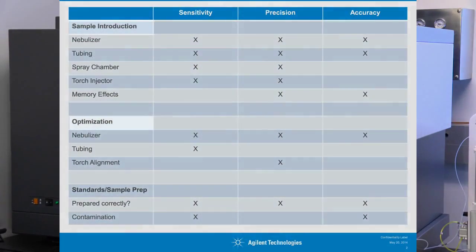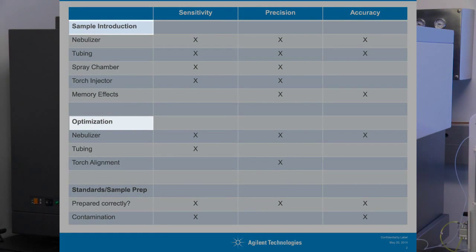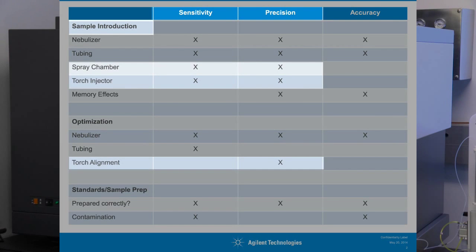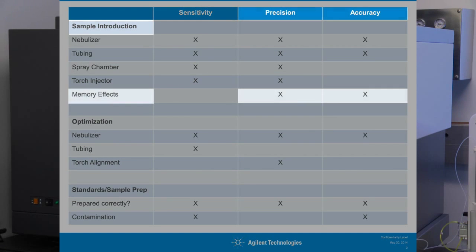First, we'll break down sample introduction and optimization. If we look at the components in sample introduction, you can see issues with your nebulizer can affect sensitivity, precision, and accuracy. The same applies for your pump tubing. We can also see that the spray chamber and torch injector can affect sensitivity and precision. Memory effects can also affect precision and accuracy.